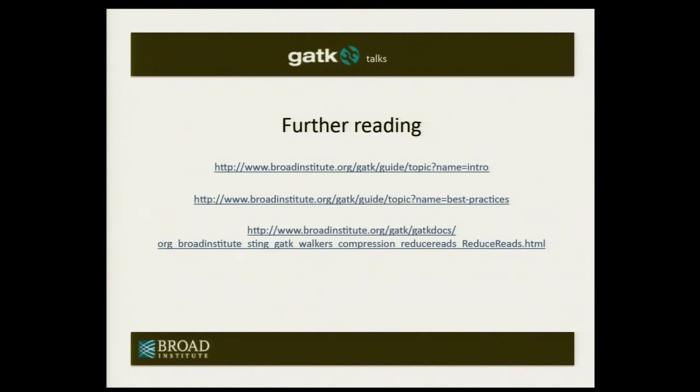Yes? Do you compress... I'm sorry, can't hear you. You compress the heterozygous variant? Do I compress heterozygous variants? This is cutting edge new technology. We just developed that. Yes, we do. If you run the GATK 2.2 something, the latest one, it will do that. It's so brand new that I'm a little worried about talking about it because we may change things in the future. But yes, we do have a new algorithm that will compress them if they're evidently het.